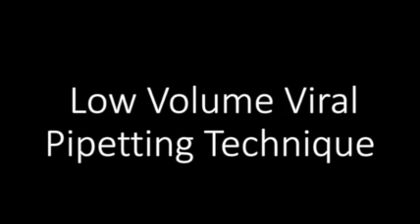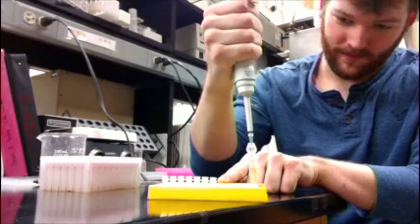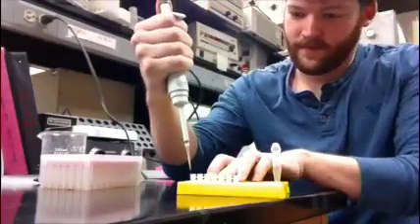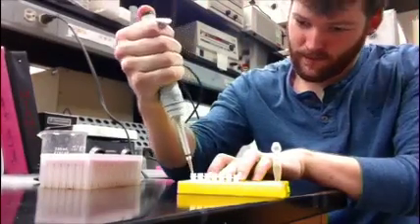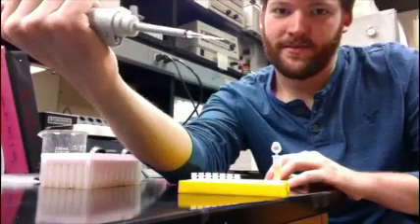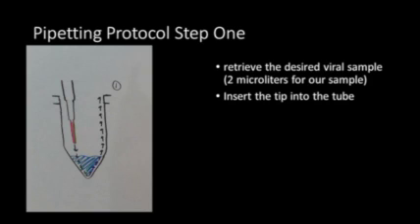So this is a really quick video that describes a low volume viral pipetting technique that we use in our lab that has been pretty effective. So you just get your sample, we use 2 microliters, and you go straight to the bottom of the tube, eject, and then slide up the side of the tube. And you can see that there's no liquid left in the tip.